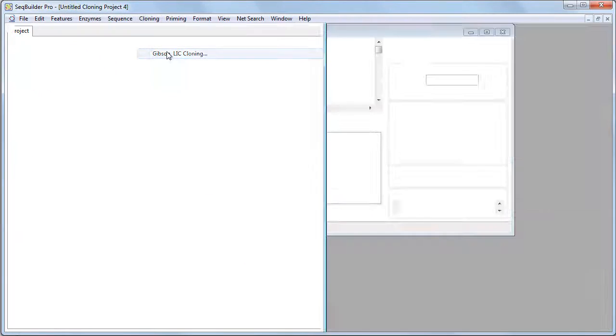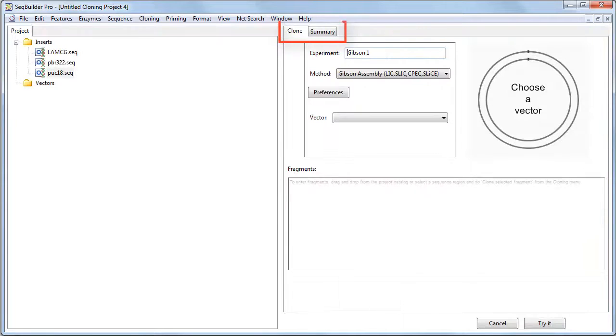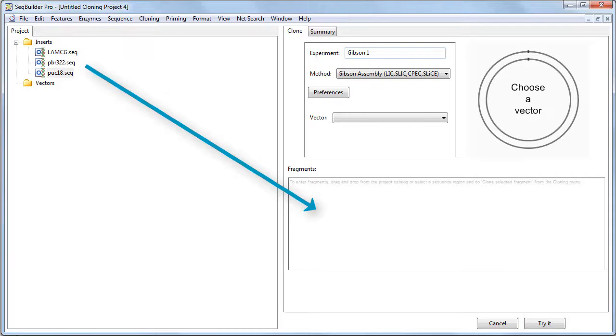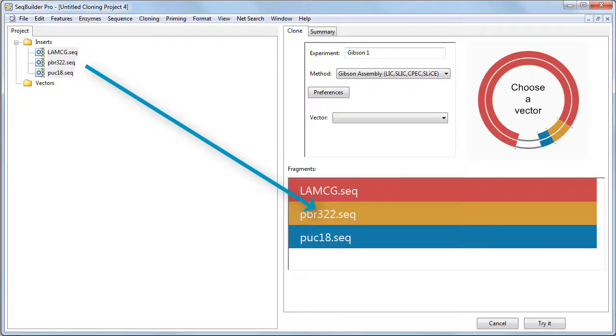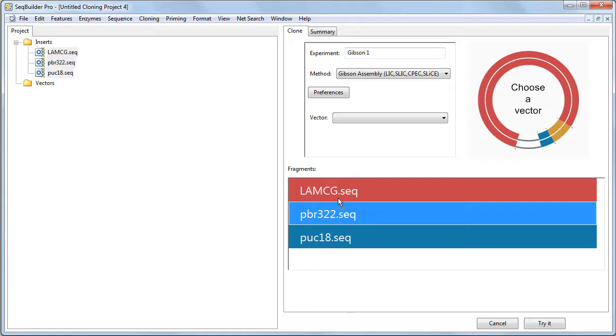After selecting your cloning method, two new tabs will appear in the Cloning Project window. In the Clone tab, add your inserts to the Fragments section by dragging and dropping them. Once there, you can reorder using drag and drop.